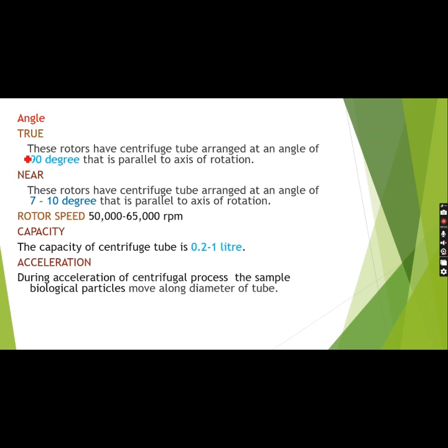These rotors are at about 90 degrees, which is going to be the angle of the central axis. This is equivalent to the central axis angle, but the fixed angle rotors are going to have 14 to 40 degrees. Here it is going to be 90 degrees.